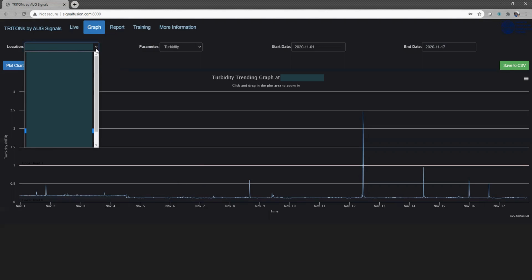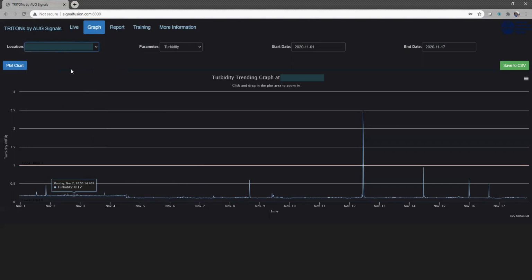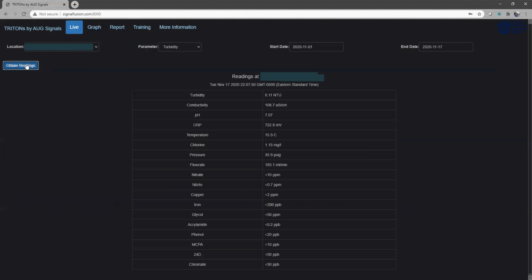Moving on to a different location. Looking at the live readings. At this location, the first thing you'll notice is the chart heading here. It's highlighted in red. That indicates that there is an adverse water quality event detected. Looking down the chart, we can immediately see that it's pH, which is also highlighted in red, and the value is 10.1. That's much too high. For this particular unit, I know the cause of this is just an old pH probe. This one is due for replacement, which I'm sure they're working on right now.